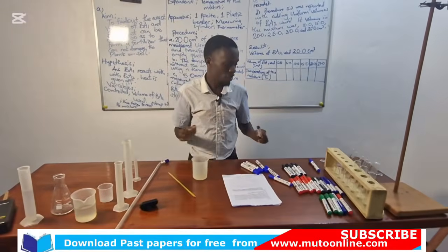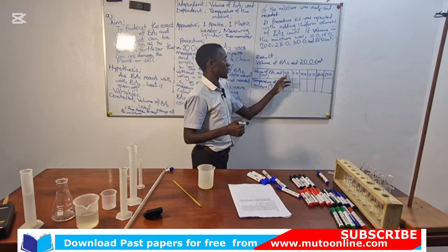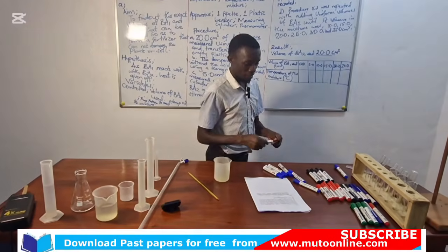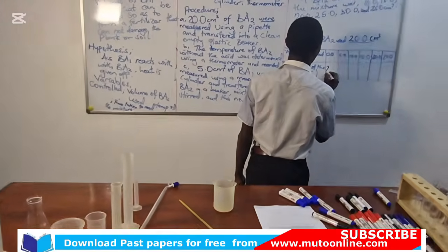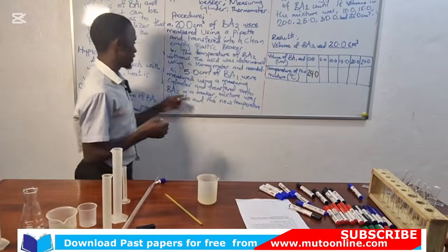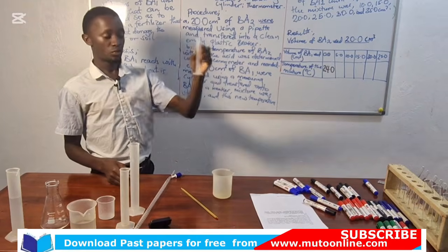So my thermometer reading, the temperature of BA2 without BA1, when 0 of BA1 is added, is 24. Members, a thermometer records also its values to 1 decimal place. So my thermometer reading is 24.0. So I'm going to go to my next procedure where I'm going to add 5.0 cubic centimeters of BA1. So I'm going to measure 5.0. I'm going to use this measuring cylinder.